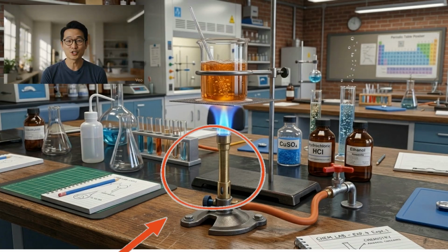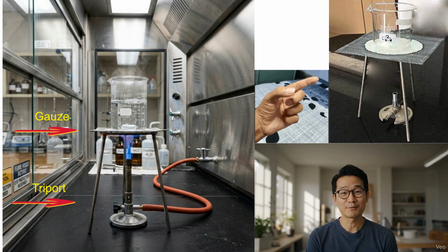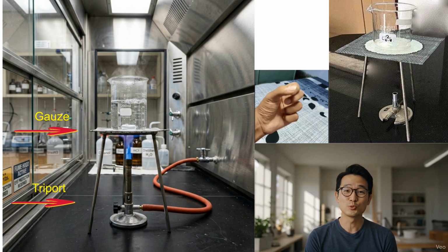This is a Bunsen burner. It is used for heating, sterilizing, or burning things. This is a laboratory tripod. It is used to hold items above the Bunsen burner, so it can get very hot during heating. It is often used with gauze.